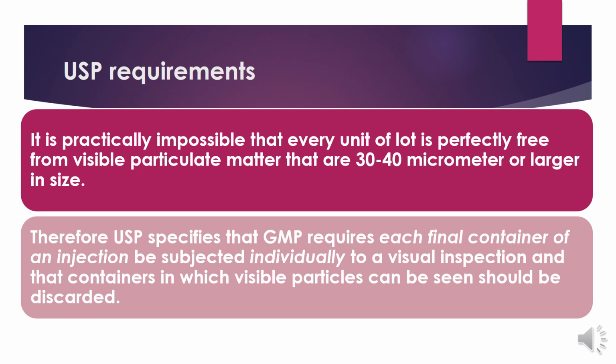Therefore, the standard specification says that each container, each vial or bottle or ampule being manufactured should be subjected to visual inspection for the presence of these larger particles. These standards also specify that those few containers or units having such larger visible particles should be discarded.